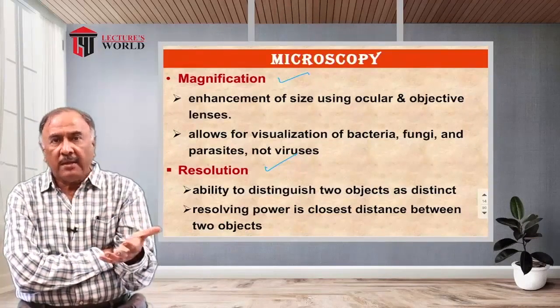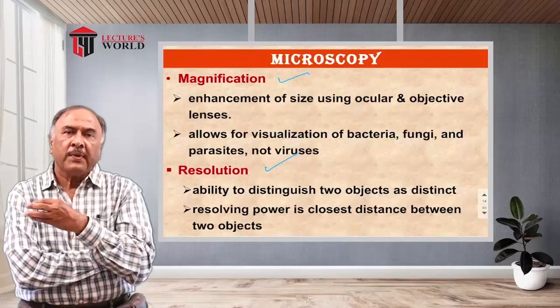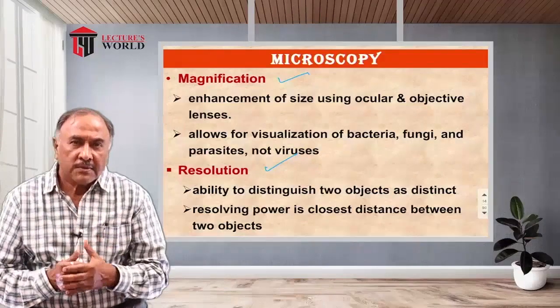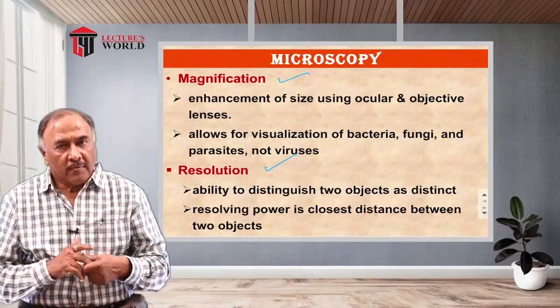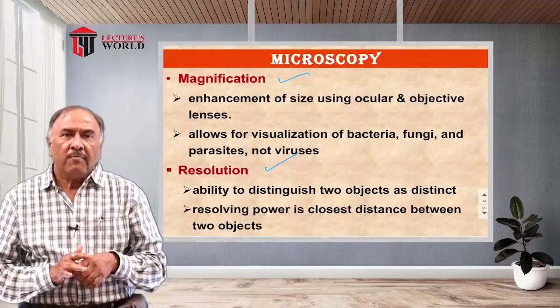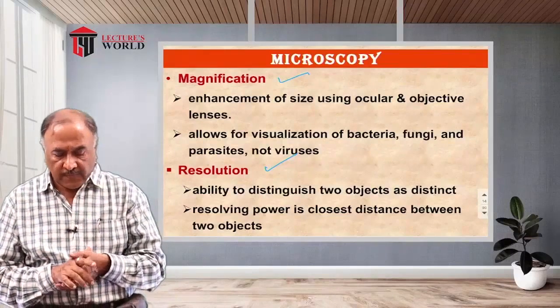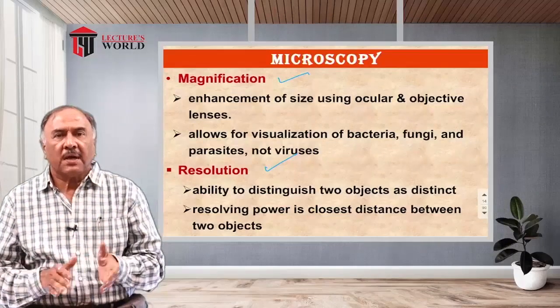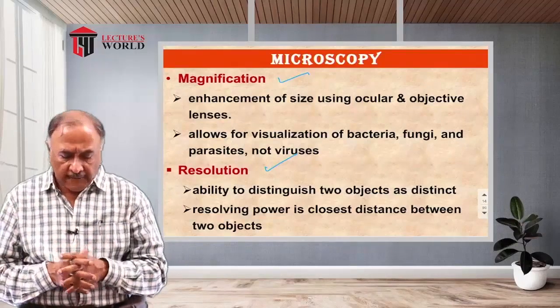Then finally, we go for serological identification. Along with that, growth and characterization, we may also carry out sensitivity testing of the culture. Genetic methods are a different category, and we will discuss them at the end.